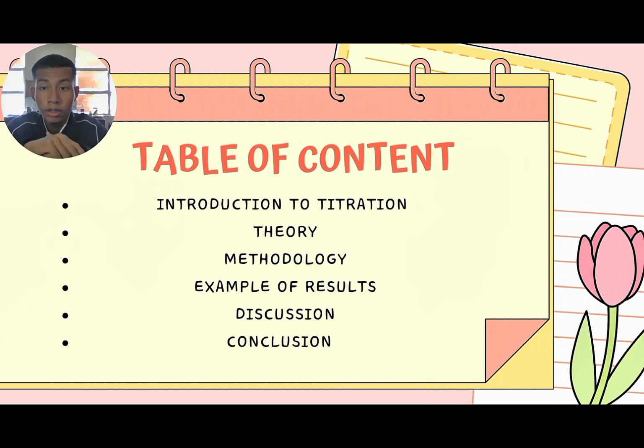Okay, so this is the table of content of our presentation. So first one we will cover what is introduction for the titration. So we are going to cover about titration, so the definition of titration, and then next is the theory about titration, and then methodology or the procedure to titrate orange juice and lemonade, and then we have example of results, and then about the discussion, and lastly about the conclusion.